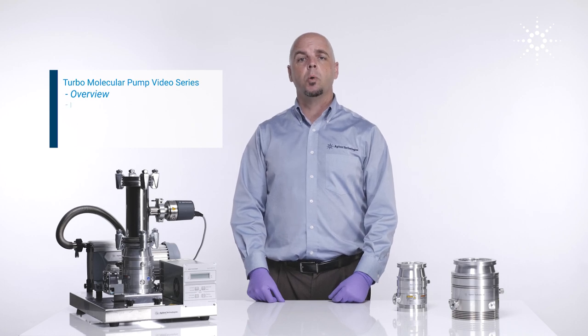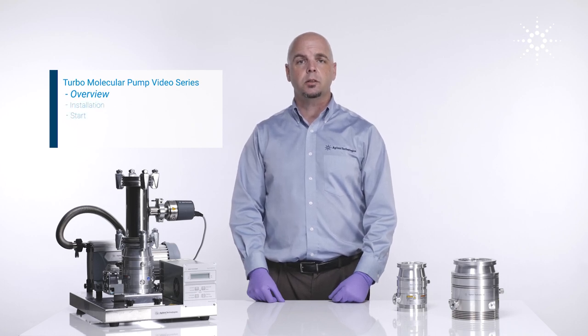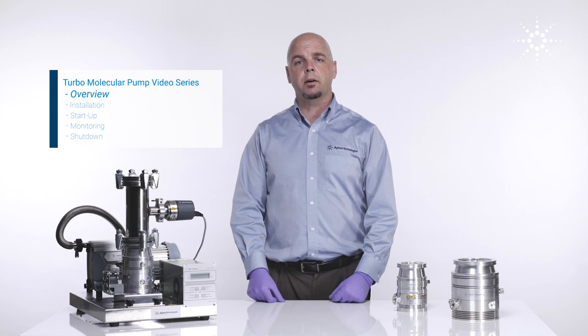In subsequent videos, we will be discussing installation, startup, monitoring, and shutdown of a turbopump and how it relates to a high vacuum system.